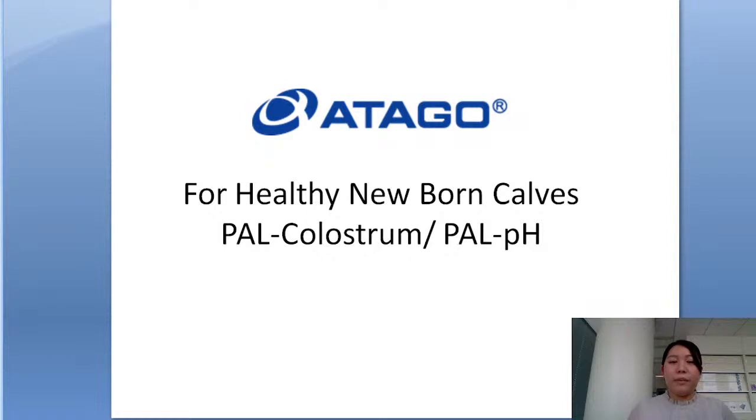So for today's seminar, we'll be talking about, as I said, colostrum. I will be talking about what colostrum is, how it benefits, and I'll be focusing on colostrum for calves. I'll also talk about our PAL-Colostrum and a little about our PAL pH, and then move to the actual measurement.